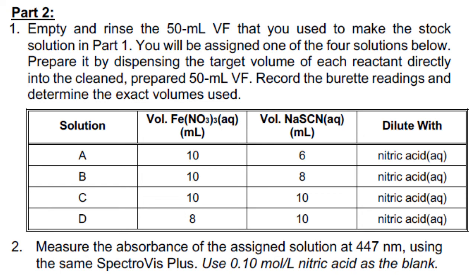In part 2, you will be assigned one of the 4 solutions shown here. Prepare the solutions as described and measure its absorbance. The value will allow you to calculate the equilibrium constant.